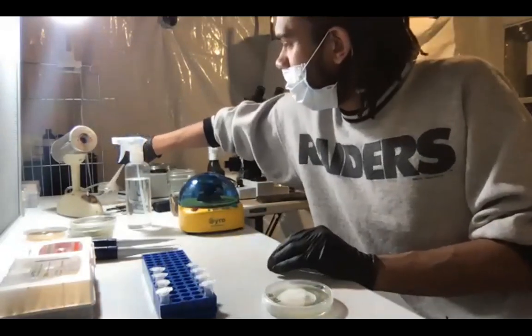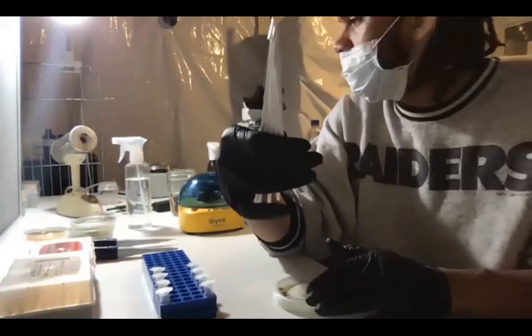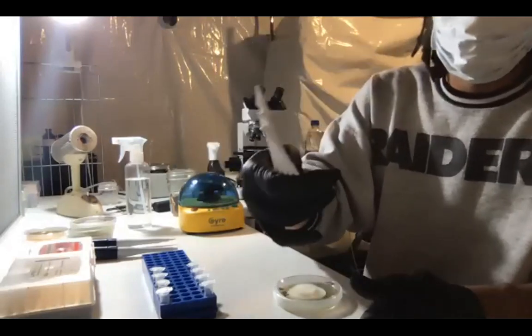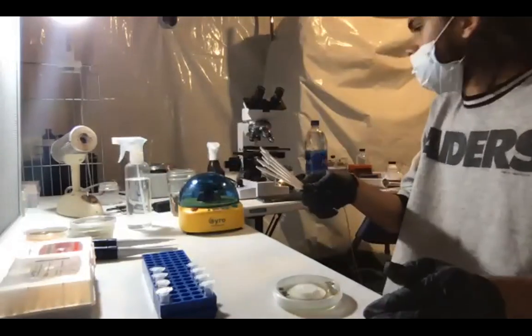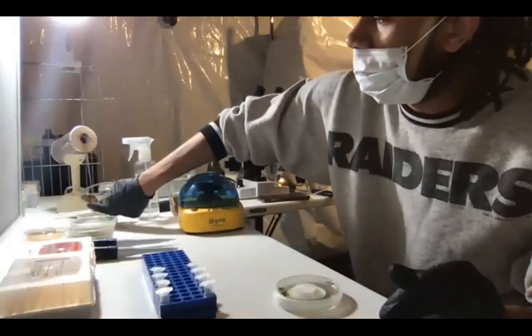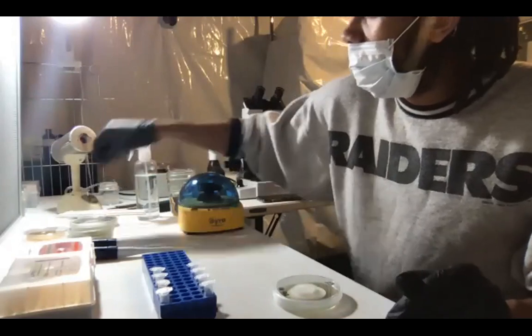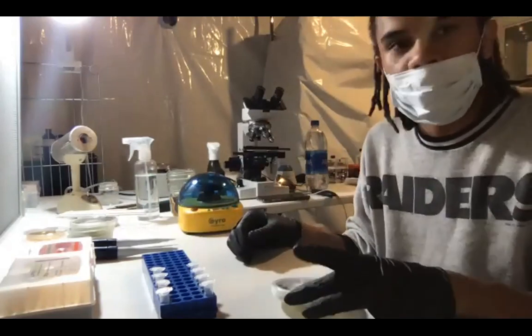I have my pestles here. These are going to be used to grind the specimen. I have these in a 10% bleach dilution. And I usually pull these out a little bit ahead of time so they can dry out in front of the flow hood. I'm just going to set these on some petri dishes to dry off, because you don't want to put bleach in your samples. So ideally these would have already been dried off. So I'm just going to let them sit over there and dry up a little bit. And we're going to go ahead and start preparing our samples.